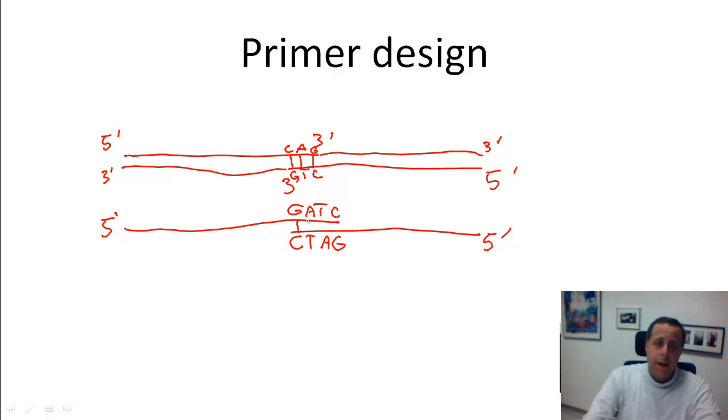Well, of course, they will be annealing to each other as well. That's why you must avoid palindromic sequences at the three prime ends of your primers. Otherwise, primer dimers will form again, not between different primers, but within the same primer.